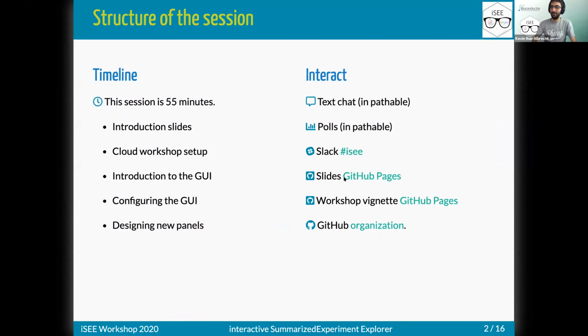All right, so the structure of the session: we've got 55 minutes or so, a bit less now. I'm going to start with a few introduction slides. We're going to set up the cloud workshop and then a bit of introduction to the interface. Federico will pick up and present the configuration. And Aaron will finish off with designing new panels that you can do as well.